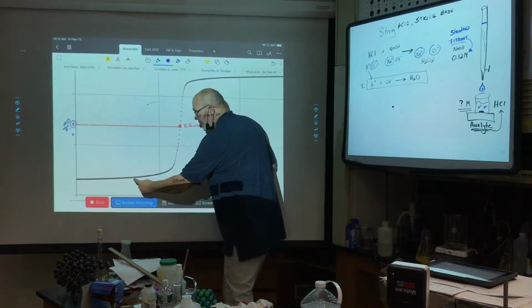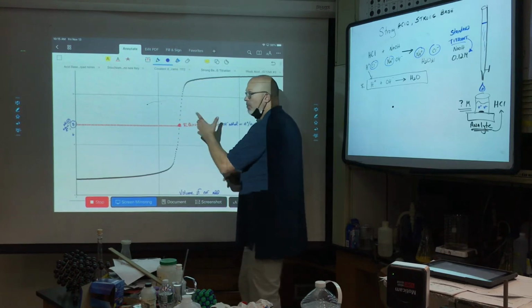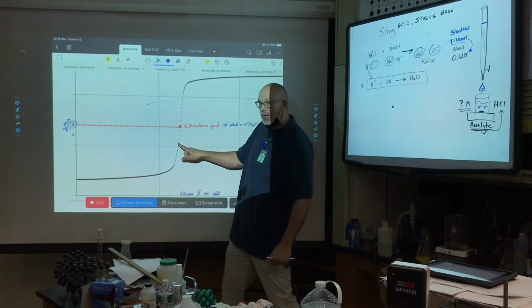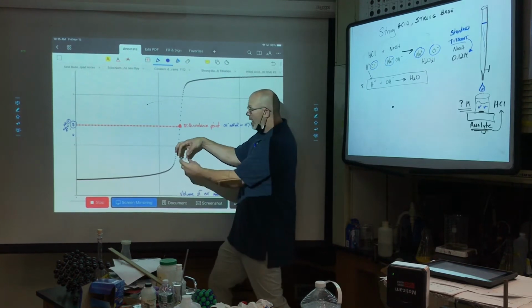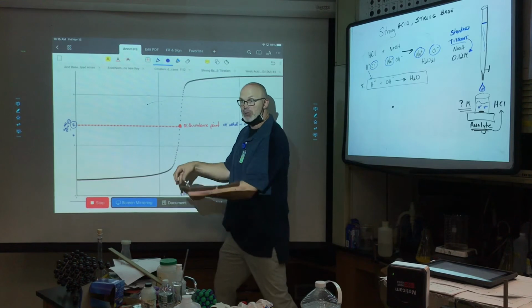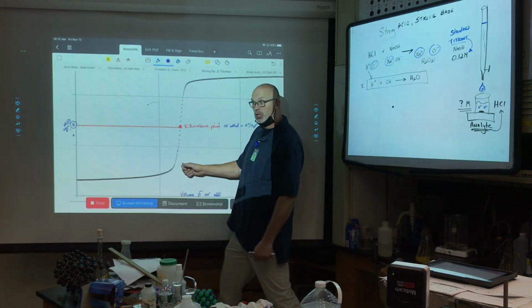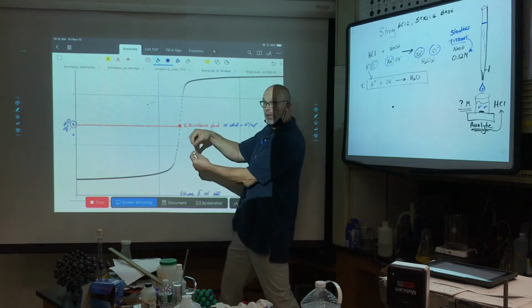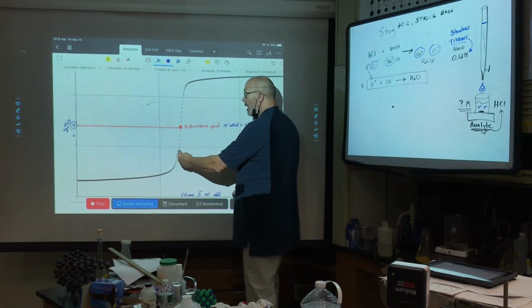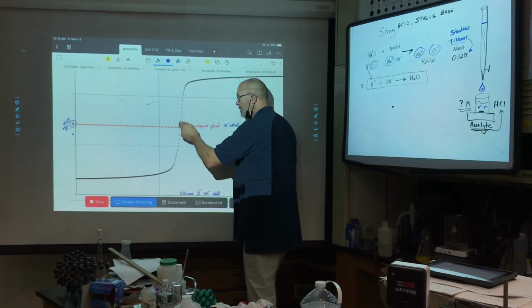By the way, this solid line is solid because the actual way that this computer worked is it was measuring the drops. This was the pH at every drop. Why are they stretched out here but so close together here? They're stretched out here because the pH was what happening here? Changing very quickly. And that's why they're stretched out. So this is just showing you the time, how fast it was changing, and then it slowed down again. This is called an asymptote.